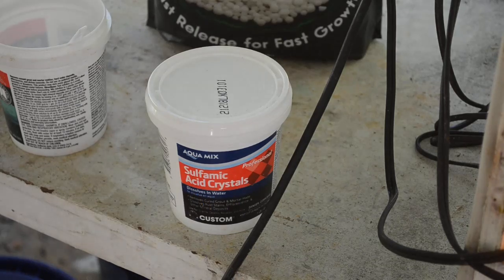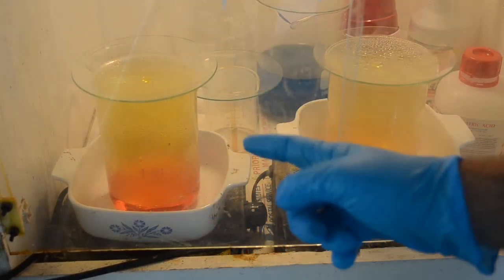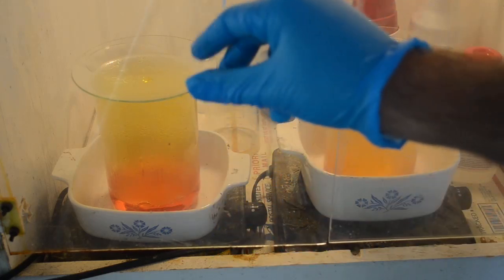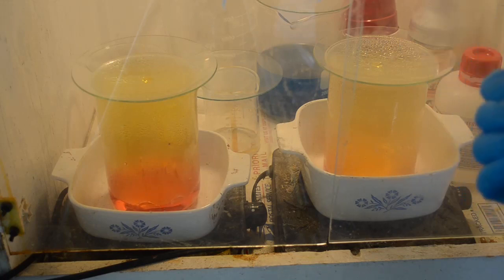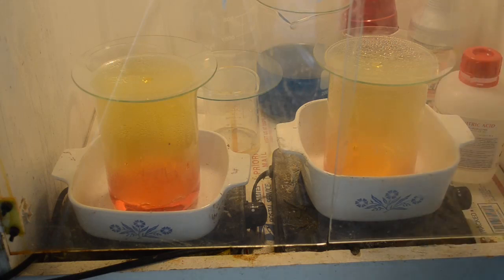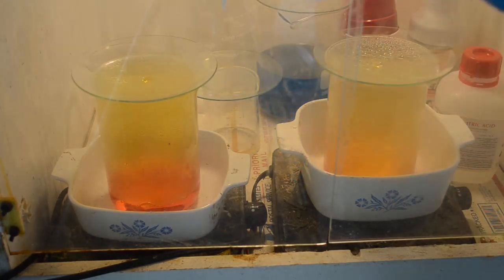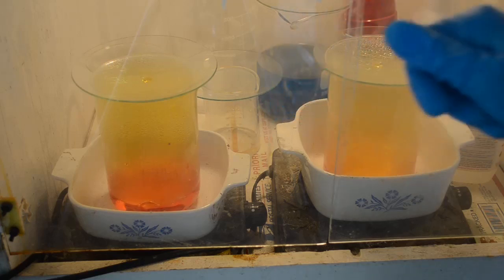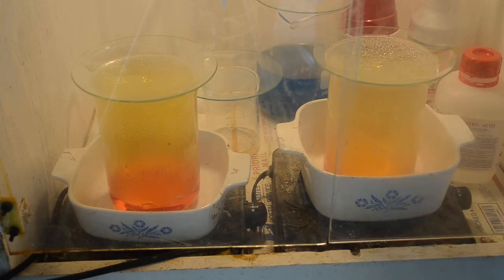So those are two ways to denox. The third way is simply: don't use more nitric acid than you need. If I was dissolving gold, I'd start out with just muriatic acid, put the gold in, and then use a pipette to drop in nitric acid until the gold was dissolved. The usual recipe for aqua regia is three-quarters muriatic acid and one-quarter nitric acid — that's too much nitric acid. You're always going to have a lot left over. If you add it a milliliter or two at a time and wait for the reaction to die down, you won't end up with a heavily over-noxed solution.